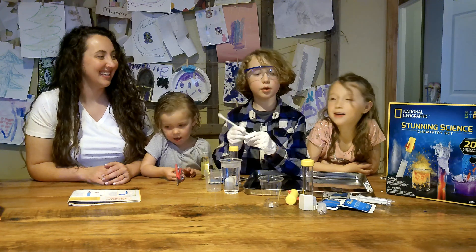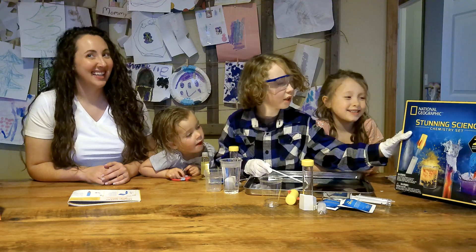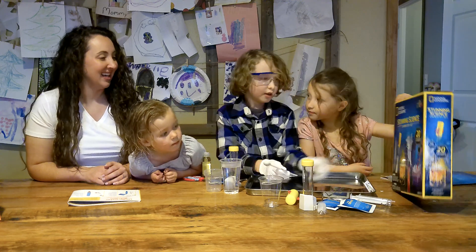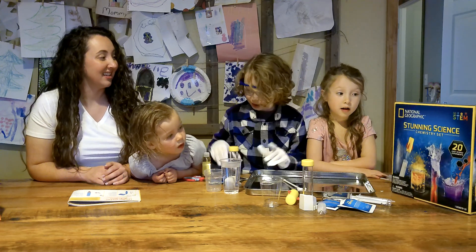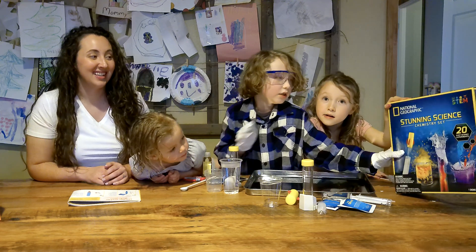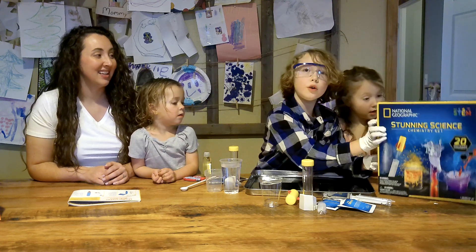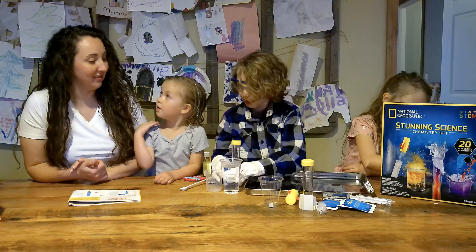Welcome to the HCM Show! Today we're going to do the Stunning Science Chemistry Kit — it's the National Geographic set. And we're going to do the underwater volcano. Ooh, sounds fun!